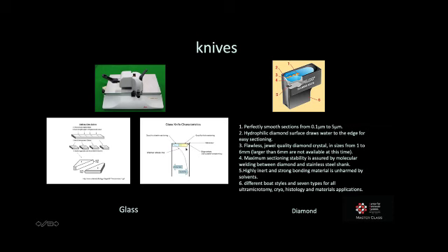On this edge, the thickest part of the stress line is our dullest part of the knife, but it's the most durable part of the knife. On the shortest end of the fracture line, we have the sharpest part of the knife, but the most fragile part of the knife. So for general purpose use, we generally stick to this middle third of the knife, which is going to be the best of all worlds. However, you can, if you need to, just move from one side to the other.